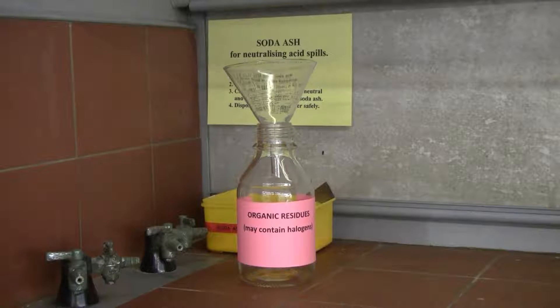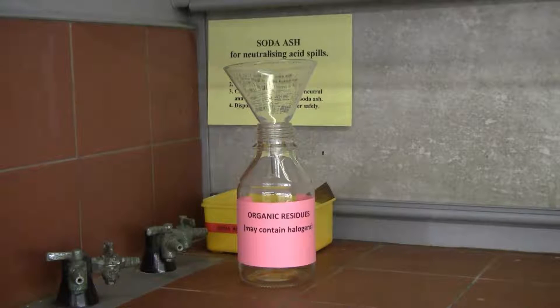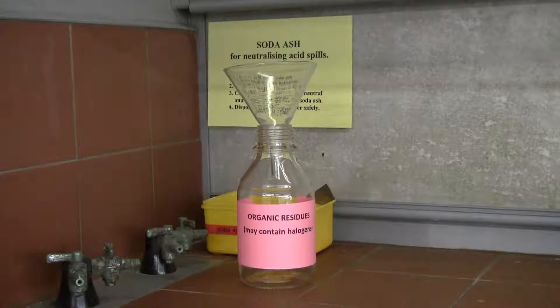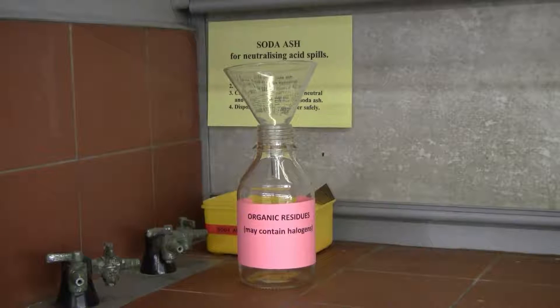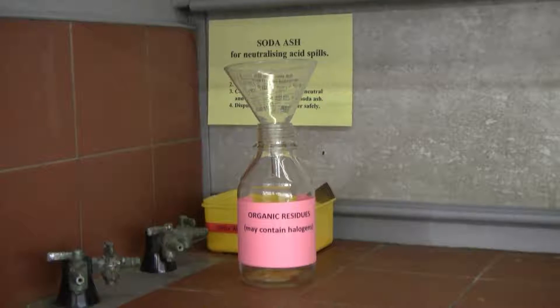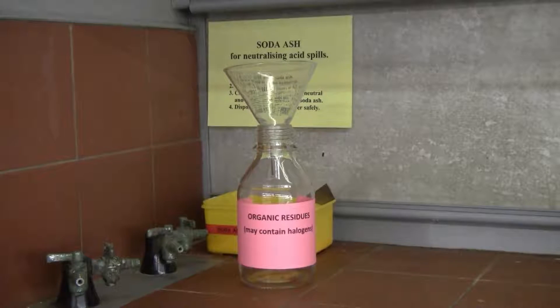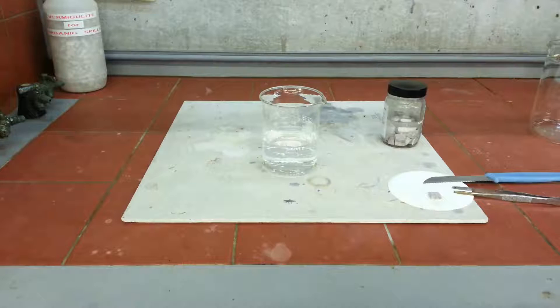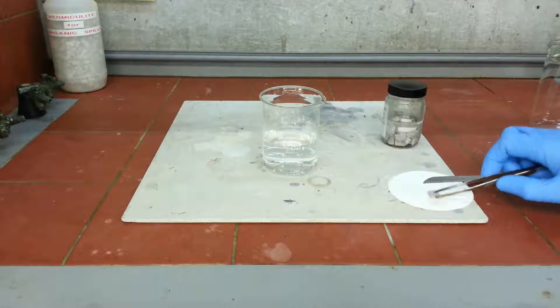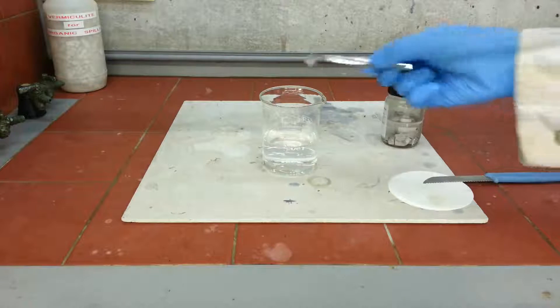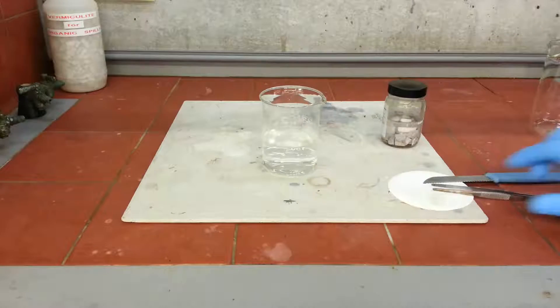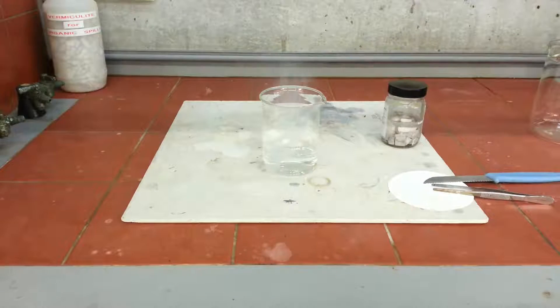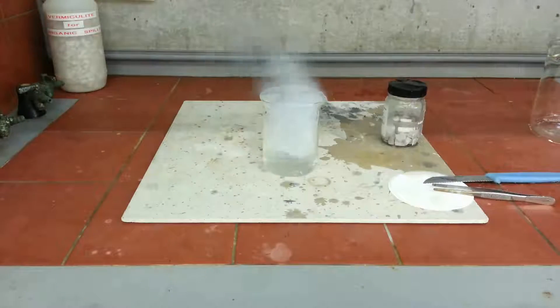You'll be doing almost all your work in the fume cupboards. You've got to be right on top of that. Today you're using substances that are toxic, that are corrosive, that are absorbable through the skin. We've removed all the known carcinogens for you, so that's nice.